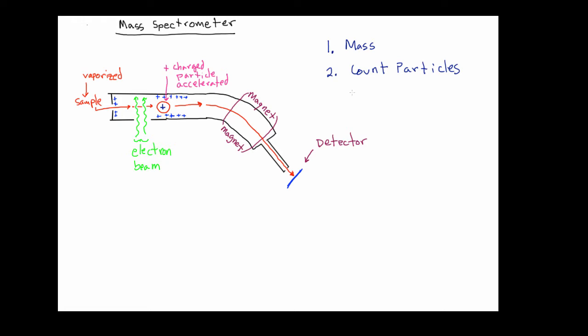And what we want to do in this video is look at how to analyze molecules that have more structure in them. Specifically, we're going to look at the mass spectrometry on propane. All right, so let me write the formula down here. It's going to be CH3, CH2, CH3.